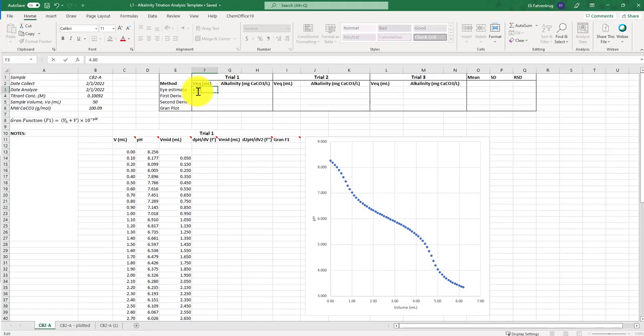because on the burette, we had 4.80. We have 3 digits that we can extract from the burette, this last digit being the one that we're least certain about, but it's the estimate between the gradation lines.